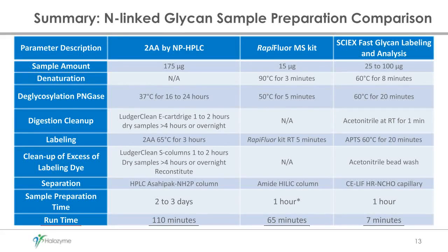Okay, so this is, I know, a very busy table. I tried to put it together comparing the three methods, and they all have great value, and at our lab we continue to use all three of them. So I'm not saying one is better than the other, but what I do want to focus on here is the sample preparation time going from 2 to 3 days. Especially if we as a small company have to schedule time with a CRO or a CMO, our price is going to go significantly lower if they don't have to spend 3 days analyzing our samples.